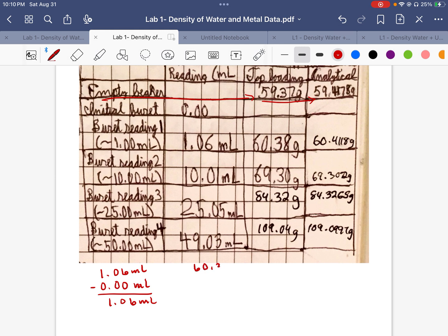minus the mass of the empty beaker, 59.37. And when we subtract that, we end up with 1.01 grams.